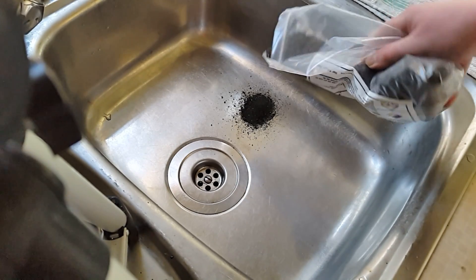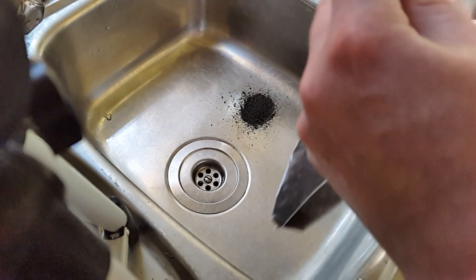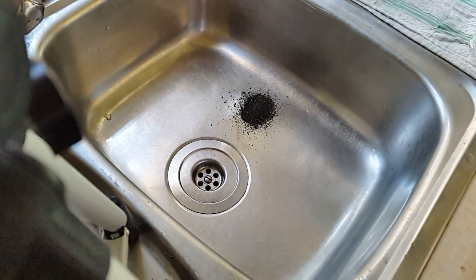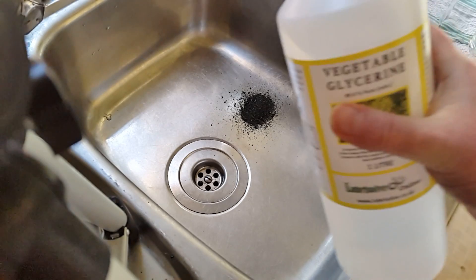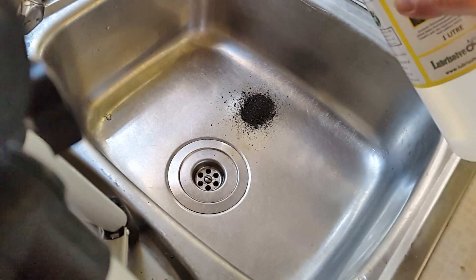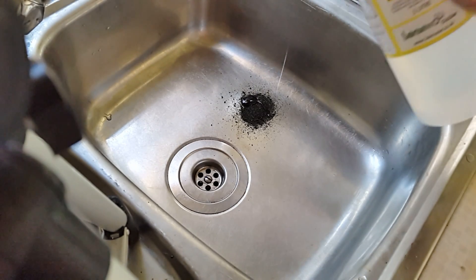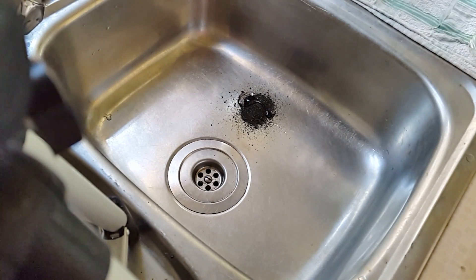We'll pour a bit of this into the lab. I know it looks like a kitchen sink — which it is. This is where I do all my burning experiments now, after I had a bit of a — shall we say — disaster with some magnesium recently. So we'll pour a bit of glycerin on there. Let's see what happens.